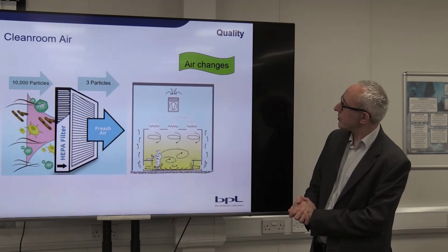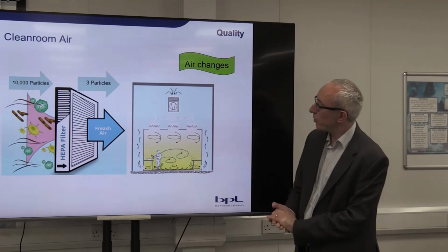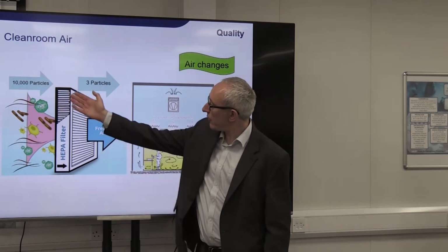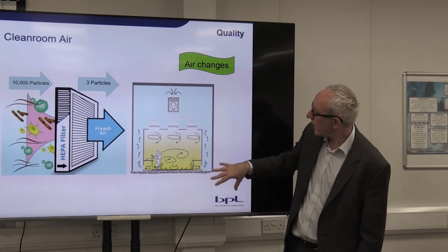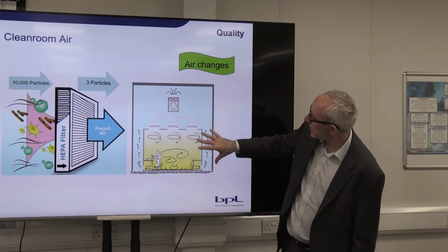So this was the concept of the clean room. So this was the point we made about the HEPA filter. So we get the thousands of particles, which are then reduced down as the air passes through. And then we get the good mixing of the air.